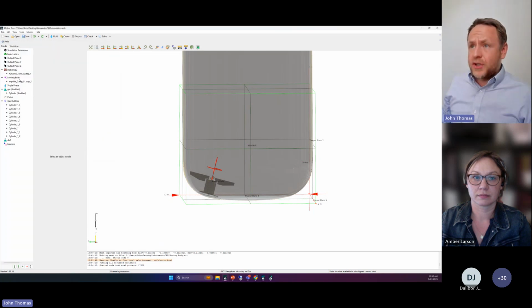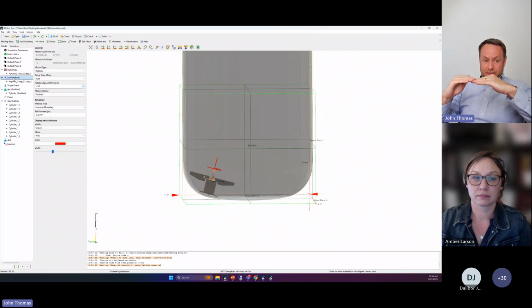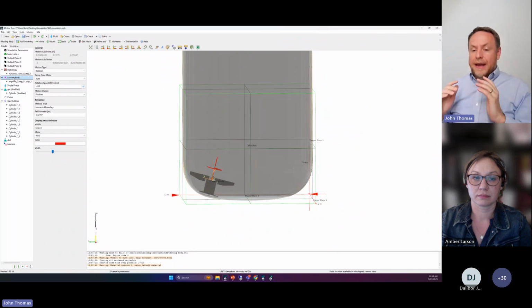Alternatively, you can have the impeller move throughout the simulation. Maybe it's one simulation and it's at the bottom, and then at T1 seconds or T10 seconds, it moves up while continuing to spin and is at the new location. So yes, and that might be a sidebar conversation, but either as a parameter sweep or within the context of the model, you can have that impeller position moving in time. Absolutely.